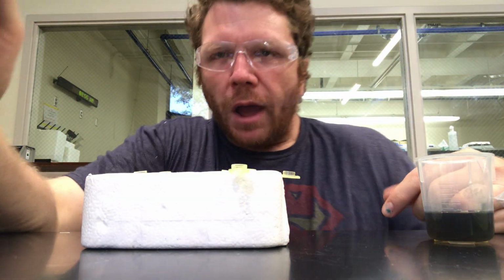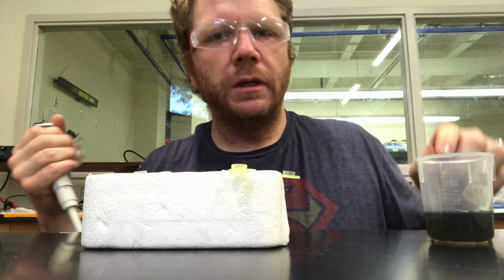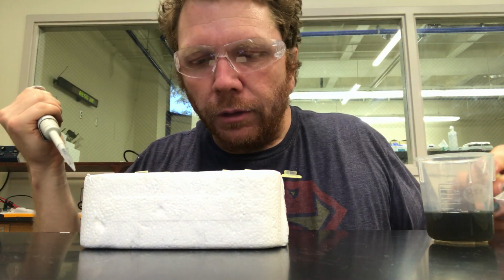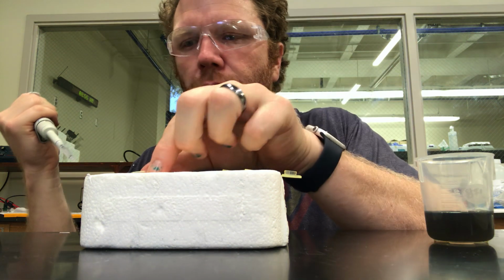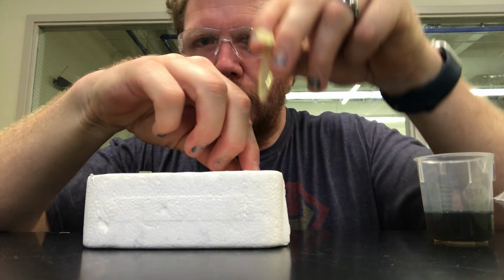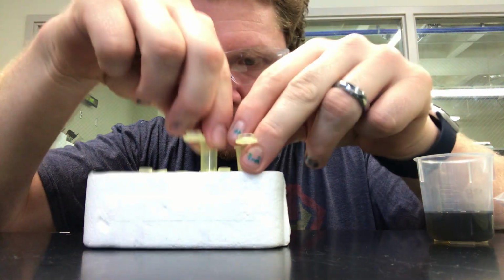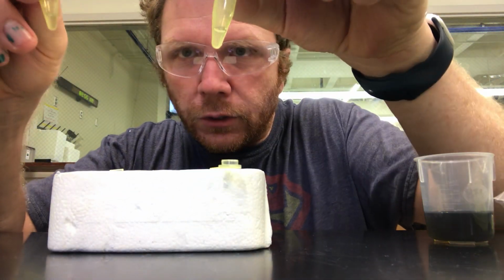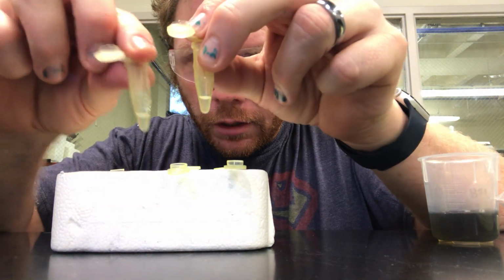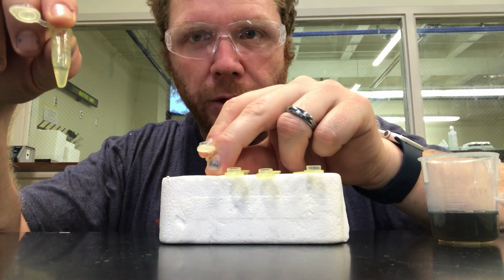All right, so now what I have is 4 tubes. The last one, I need to add 100 microliters of deionized water to make sure that it's the proper dilution. Okay, so in all of my microcentrifuge tubes, my volumes are going to be the exact same. Here's 1, here's 2. Here's 2, here's 3. Here's 3, here's 4. The only one that's going to be different is my very last microcentrifuge tube.